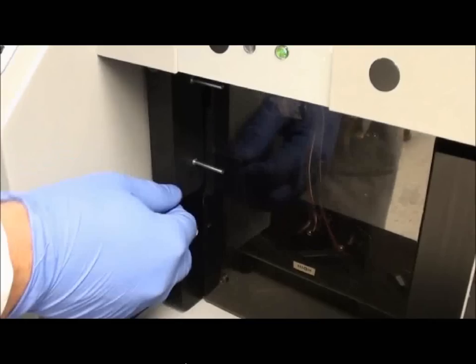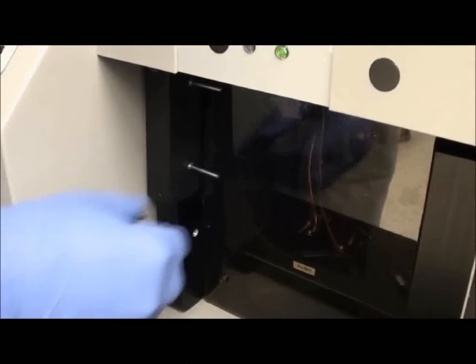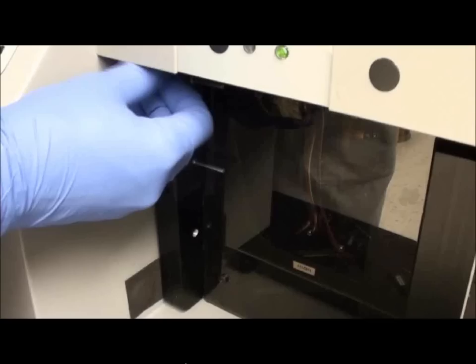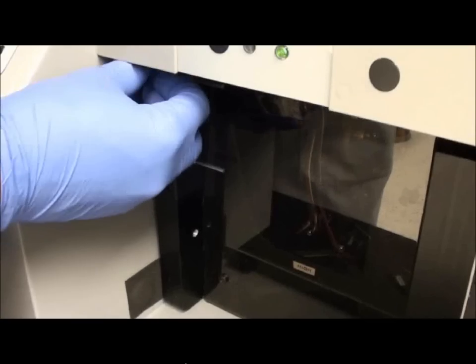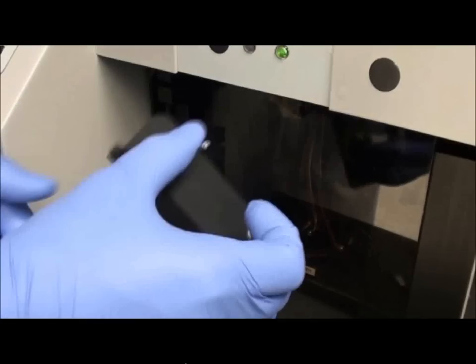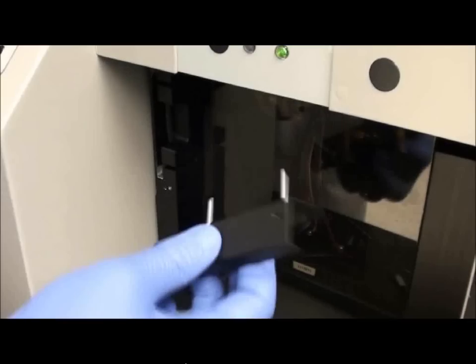Next, we'll access the emission filter wheel via the filter access panel. We'll want to remove the thumb screws that hold the panel in place. And we'll remove the filter by positioning the filter access panel pins into the corresponding pinholes on the filter.